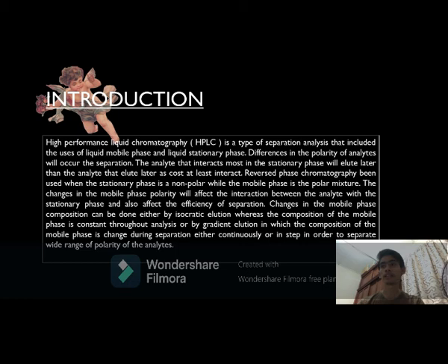Changes in the mobile phase composition can be done either by isocratic elution, whereby the composition of the mobile phase is constant throughout analysis, or by gradient elution, in which the composition of the mobile phase is changed during separation either continuously or in steps in order to separate a wide range of polarity of the analyte.